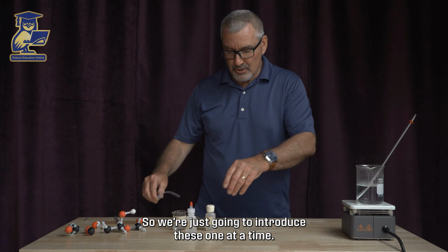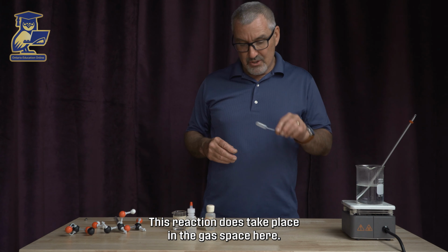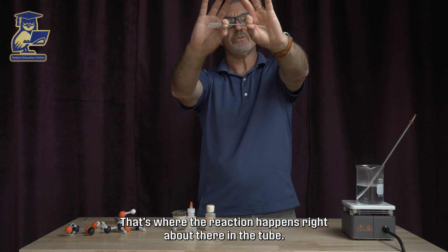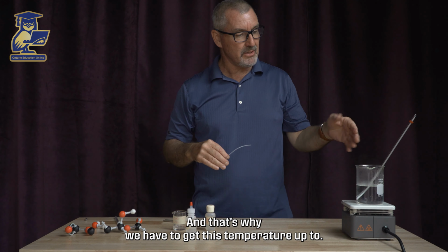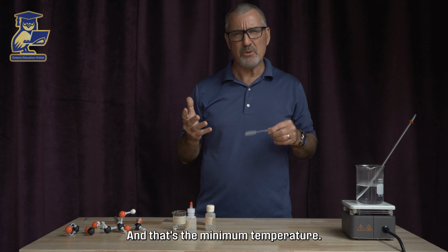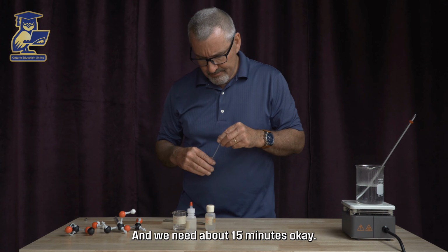So we're just going to introduce these one at a time. This reaction does take place in the gas phase. That's where the reaction happens, right about there in the tube. That's why we have to get this temperature up to, and we're right at 85 right now, and that's the minimum temperature, and we need about 15 minutes.